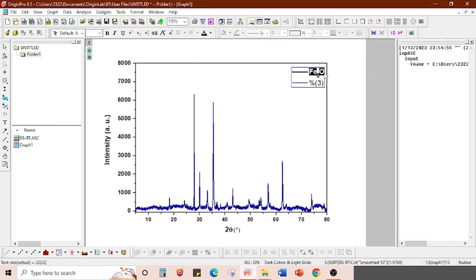Now copy this, control, and I'm going to paste it here. Click here, before cursor goes before. Delete it. Come down. Have your mark. So now our graph is completely ready to export.